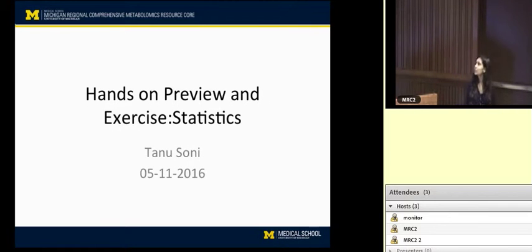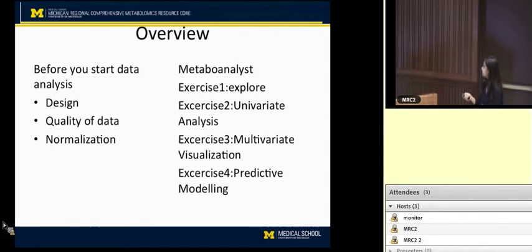Afternoon. So this is just an overview of what we are going to talk about in tomorrow's hands-on session. It will get you started with the MetaboAnalyst website, loading your data, and getting you familiar with the tool. So for tomorrow's session, just an overview before you start your data analysis.